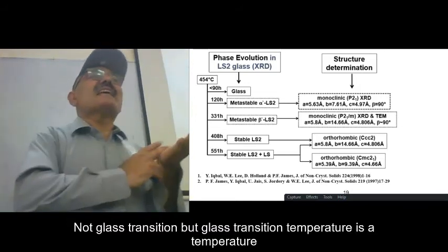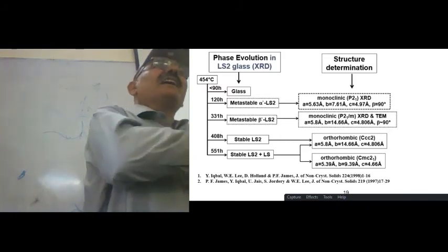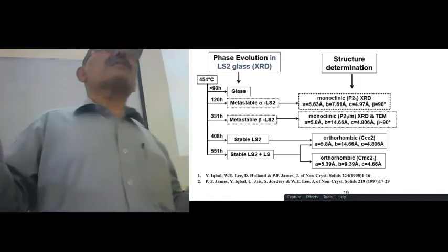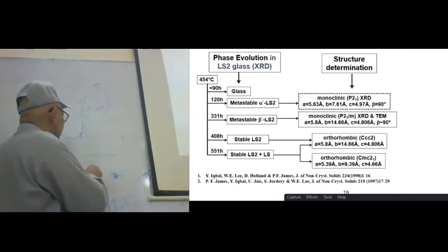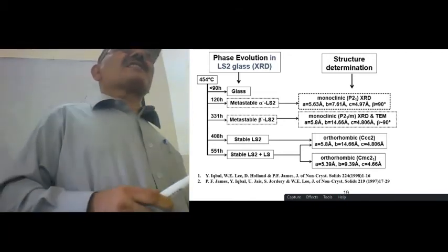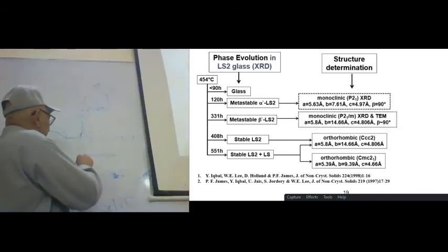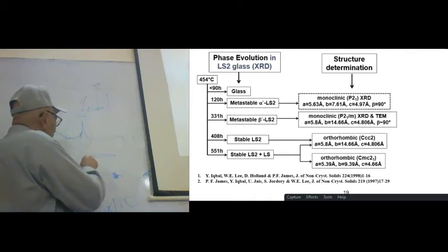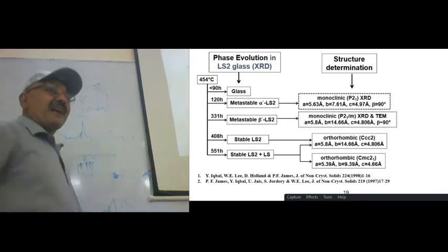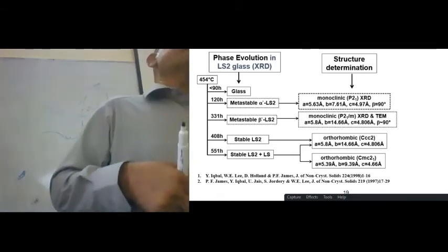You can make thin strips of a metallic material, fix it on a glass slide, and take it into XRD. But when you take such material to XRD, what happens inside? I put this solid piece in the XRD, and the material crystals are preferentially oriented. Preferentially oriented means, for example, the C direction of all unit cells is like this. And when the X-ray hits it, the C axis contributes more than the A and B axes.